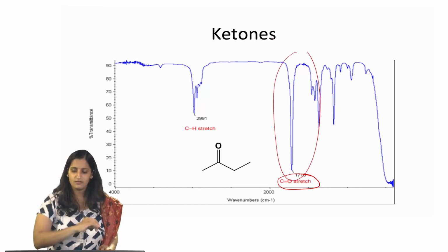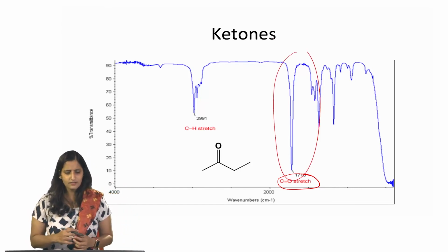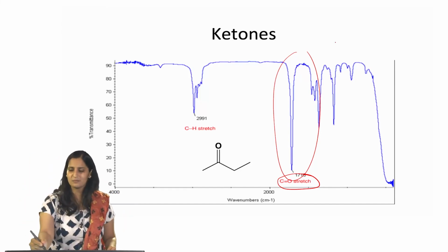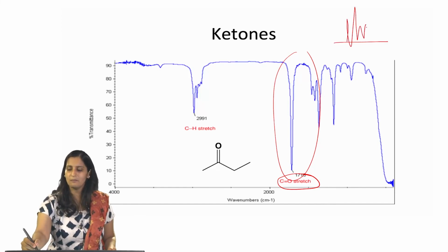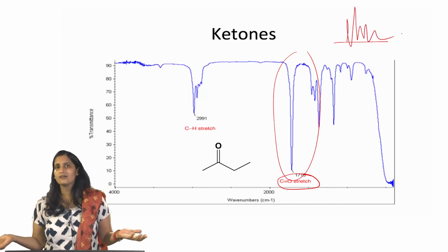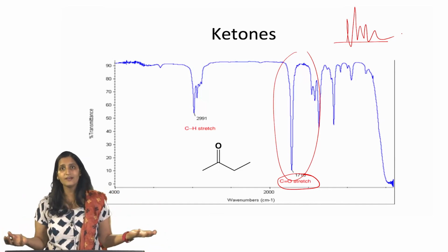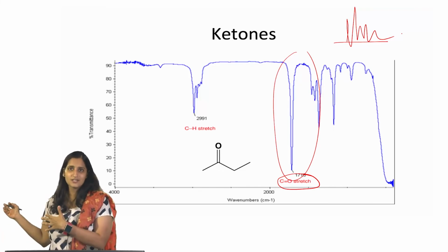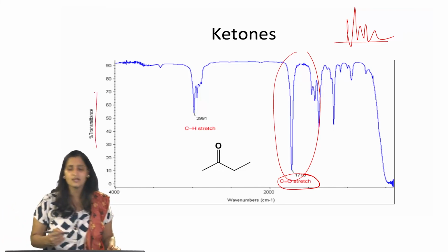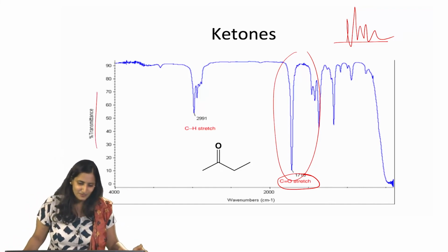Okay. And you might be wondering why we are plotting transmittance, with peaks going down, versus most spectra where the peaks go up like this. Well, the story goes that the first time IR was recorded, it was recorded upside down, and henceforth chemists have just followed this tradition. So, we record percentage transmittance, not absorption, although IR is an absorption spectroscopy.